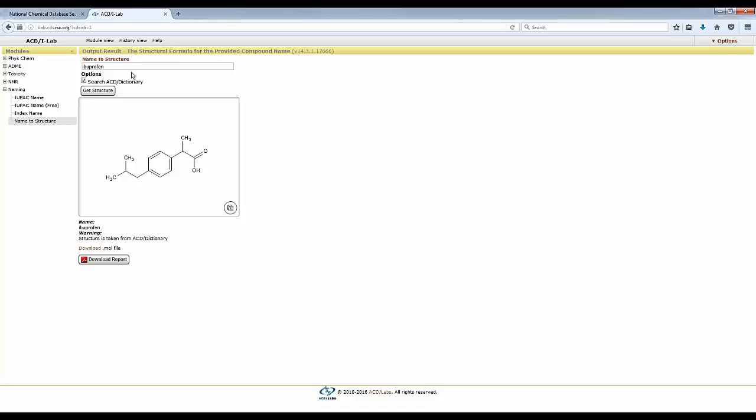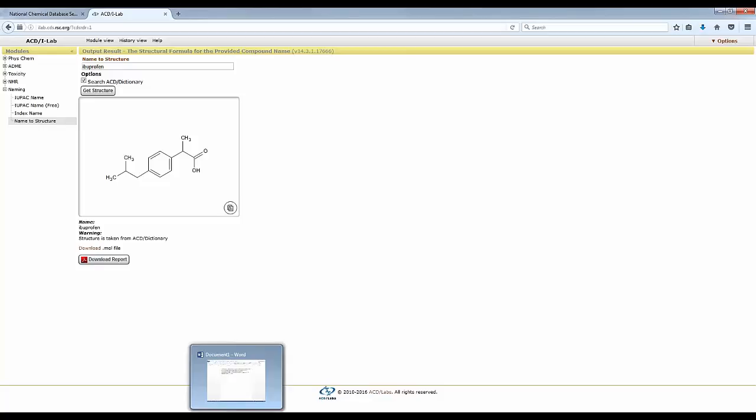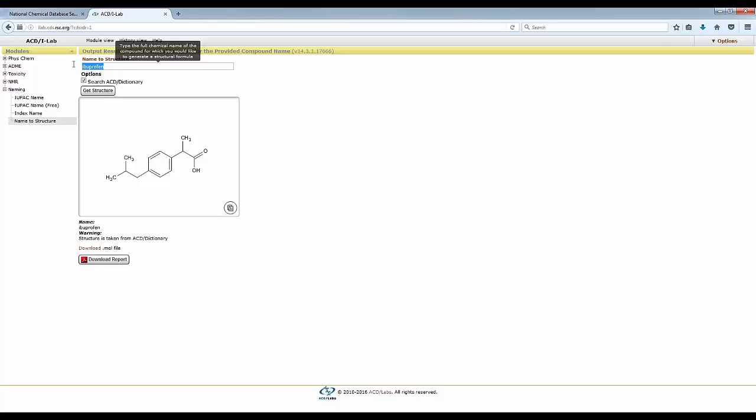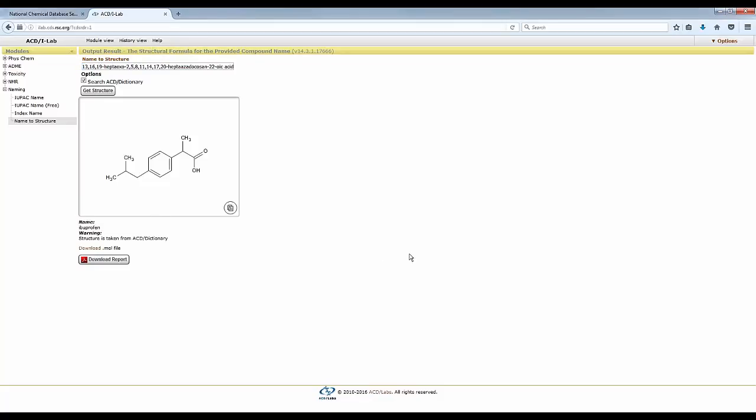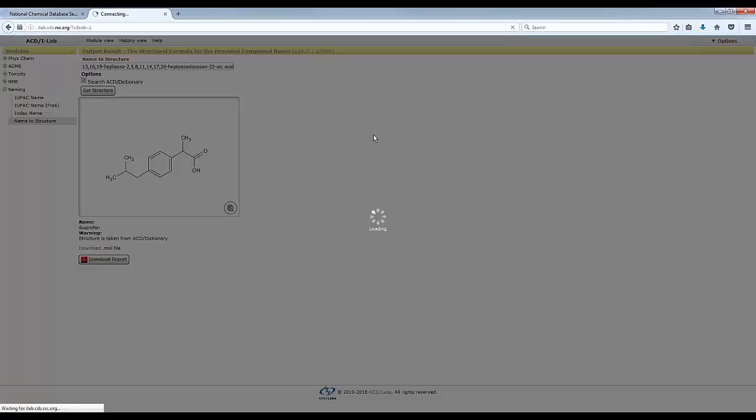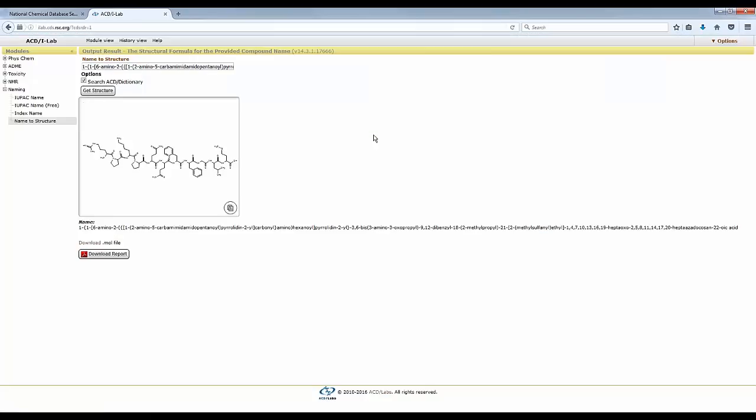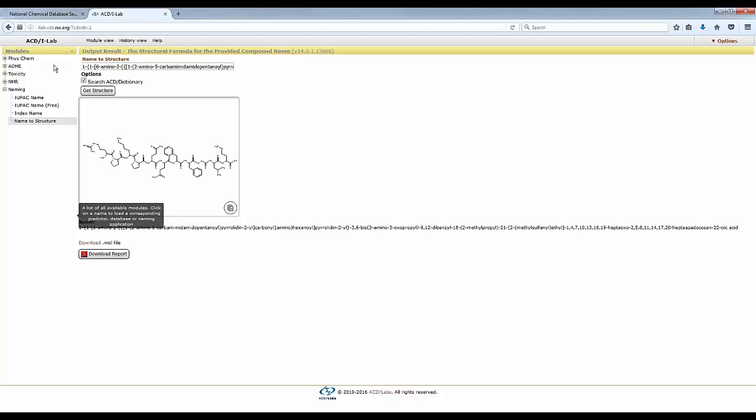Now, name to structure will work quite reliably with all sorts of names. And just to show you the strength of it, I have here a very big name. Let me just copy it. So if you have a name like that, which goes quite a bit, I can click get the structure. And it's going to give me the structure. So as long as the name is compliant with the rules, you will get a structure. Let's copy the structure. This looks an interesting one to deal with.